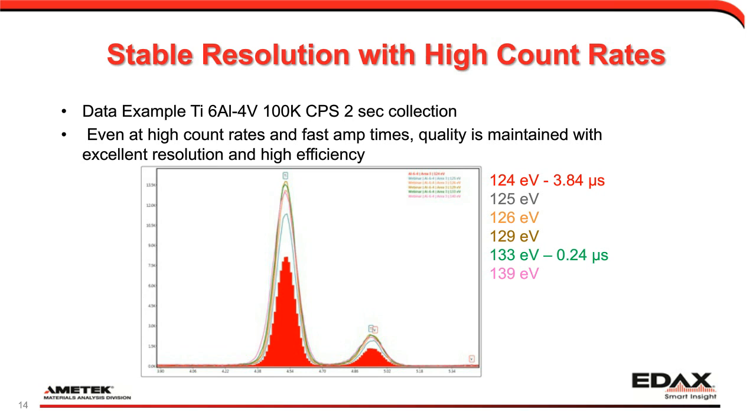So in the first view that we see here, we have the titanium K-alpha and K-beta peaks, along with our vanadium K-alpha peak hidden underneath that titanium K-beta peak. And we see how the spectral resolution doesn't change very much at all when we look at the overlay. In this overlay, we're not scaling all spectra to the highest point. The slowest amp time has the least amount of data for any given count rate, because it has the higher dead time or slower processing, fewer X-rays per second. And so the red spectrum, while it has the best resolution, also has the fewest number of counts.